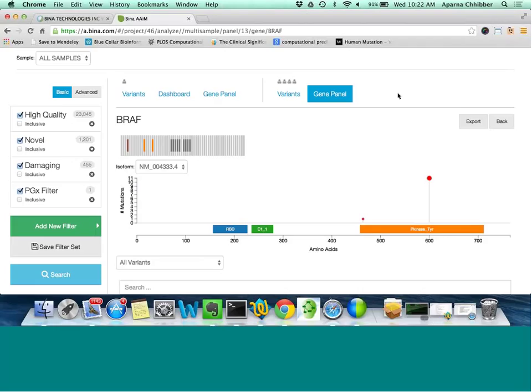So we had a question early on while we were going over the databases about EXAC. We will be adding EXAC, or working on adding EXAC databases to our set of population frequency databases. There's a question about the limit of detection for somatic mutations in our software.